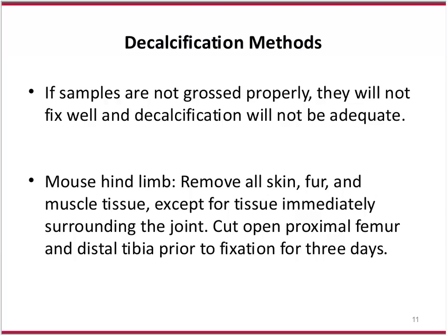And we cut off both ends, the distal and proximal end of the femur and tibia, in order to allow the fixation to penetrate for 3 days. We do a 72-hour fix, and then we will do a good rinse.